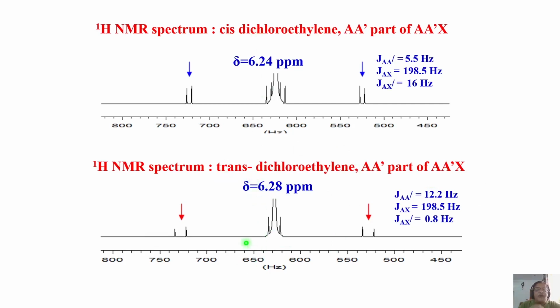And if you still ask me how do you identify which is which, I will do a simple analysis of carbon-13 satellites, looking at the proton-proton coupling which is reflected in the satellite spectrum. I know which is trans and which is cis. You got the point now?